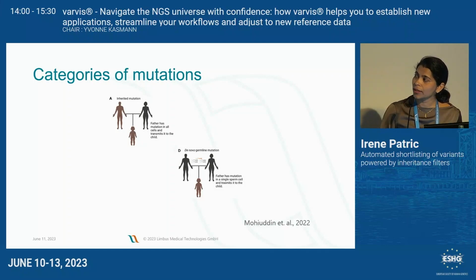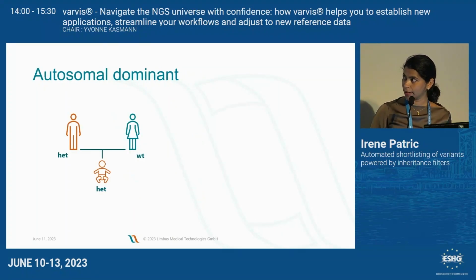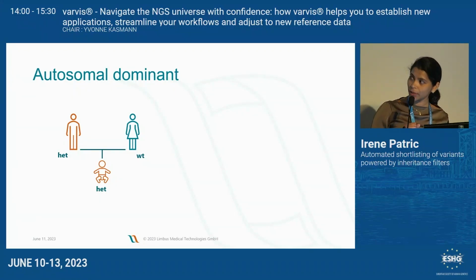In addition, like I said, is mosaicism, which is a big topic. But I will just touch upon Mendelian presentation of this, where a parent is a carrier, but is not affected themselves and passes on to the child. Again, I will start off with the autosomal dominant filter, a simple inheritance.